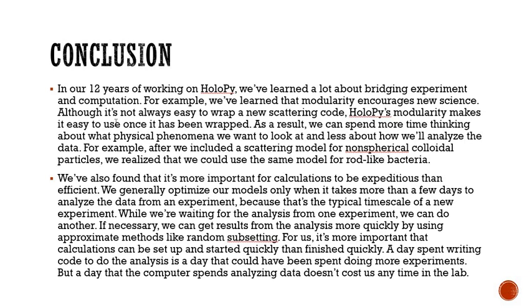A day spent writing code for analysis is a day that could have been spent doing more experiments, but a day that the computer spends analyzing data doesn't cost any time in the lab. That's why they are using holopy to extract the data, rather than sitting in a lab constructing and writing code to use the data and the publications.